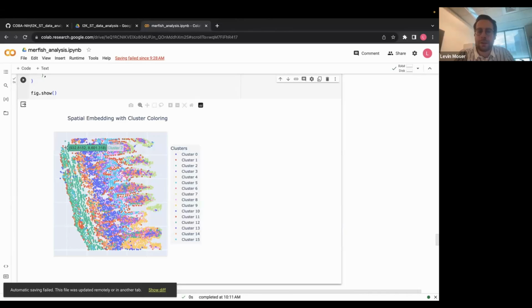These individual dots are the same output that you get from single cell sequencing. And now the amazing thing about spatial transcriptomics is that you actually can map them to an XY coordinate.